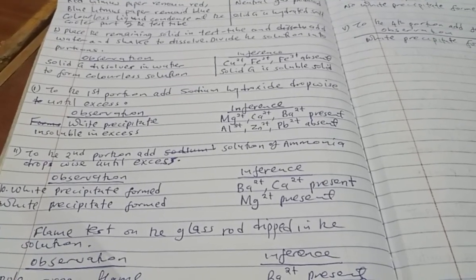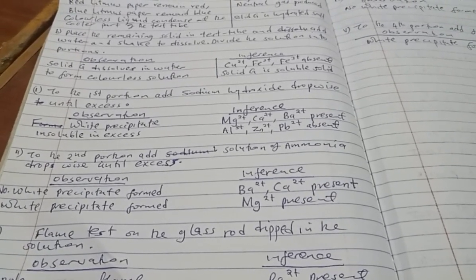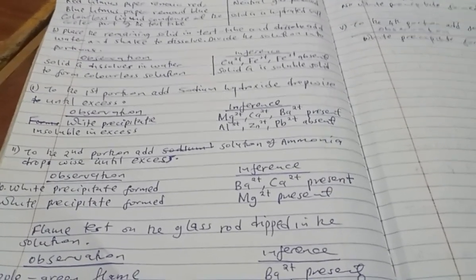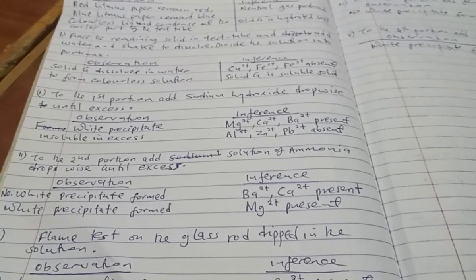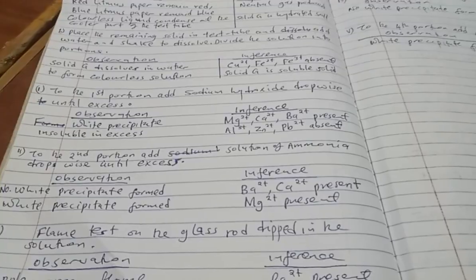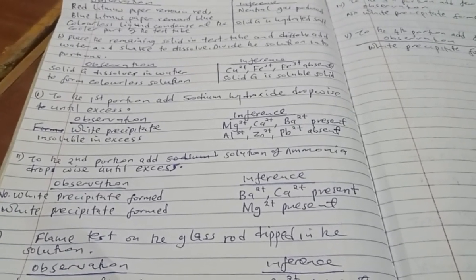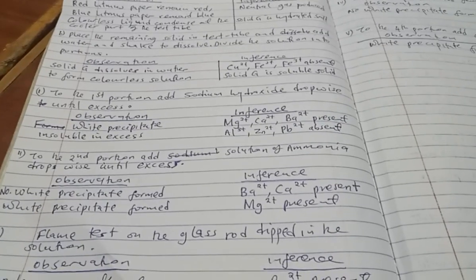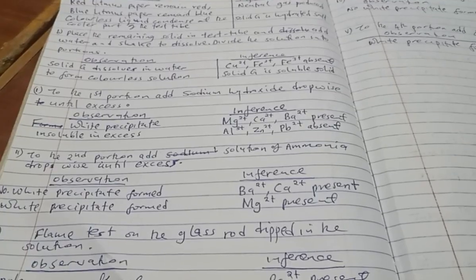If no white precipitate formed with ammonia, then we can easily say that barium ion and calcium ion are present because they don't form white precipitate with ammonia. Since ammonia is a weak base and does not normally give enough hydroxide ion to react with barium and calcium ion. So if no white precipitate, then you can comfortably say that barium ion, calcium ion is present.